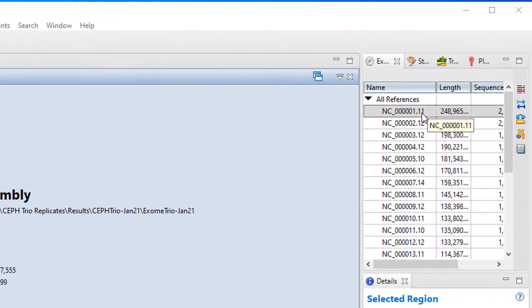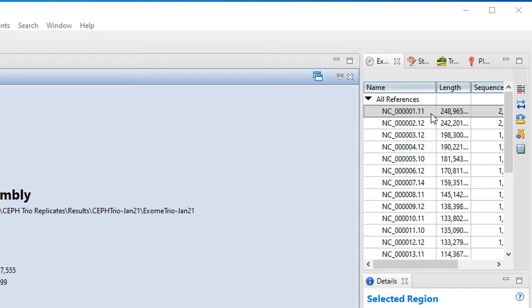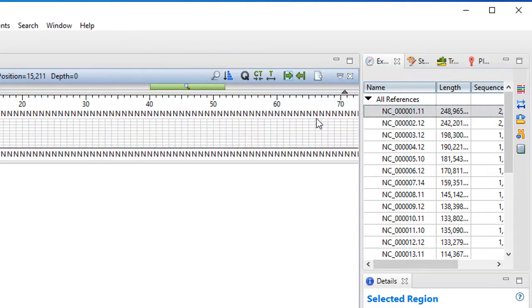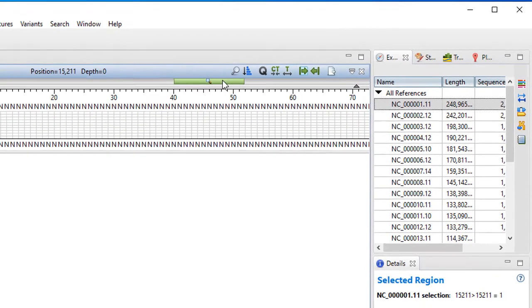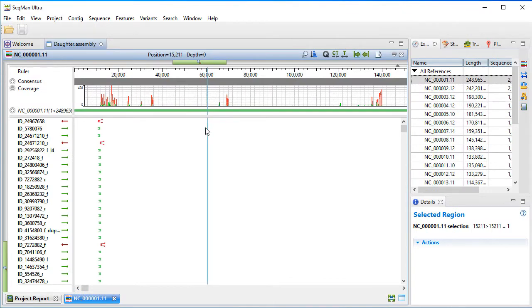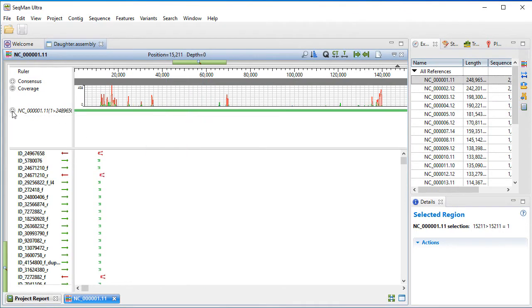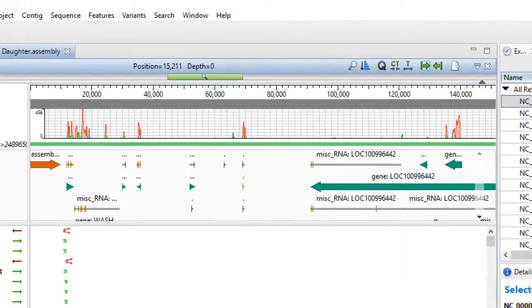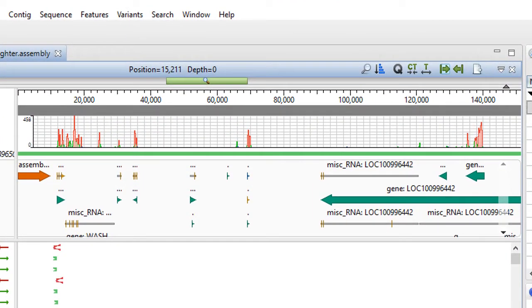In Seekman Ultra, you'll see a list of contigs, in this case human chromosomes, that contain the exome alignment. Double-click on a contig to open the alignment view. You can then zoom out to view coverage along the chromosome, as well as annotated features on the reference sequence.